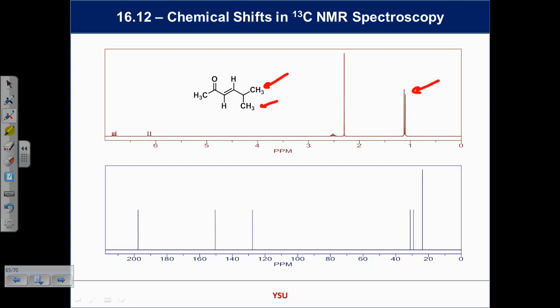They are alkyl groups, so therefore to the far right. Look how that corresponds up here. That signal for the carbons of those methyl groups is still to the far right. Not deshielded very much. Then we move down. What signal is this? It's a 3-hydrogen singlet. What is that? It's next to the ketone. Alpha to carbonyl.